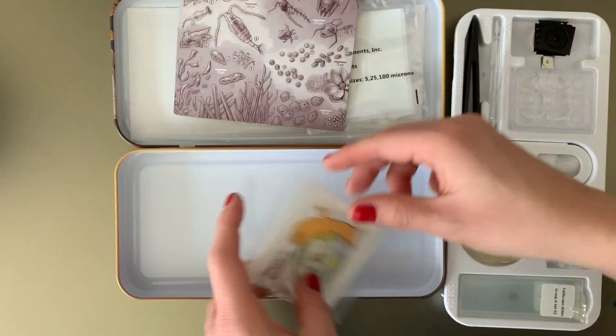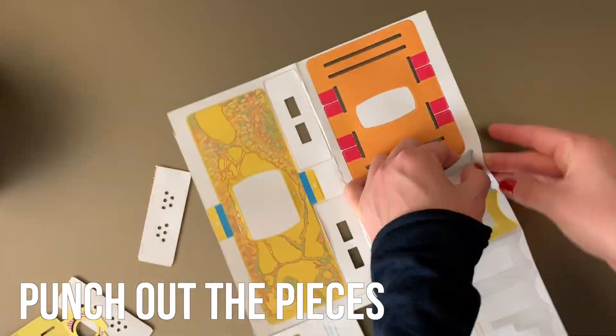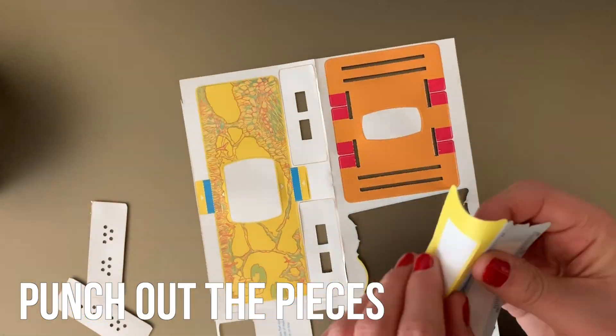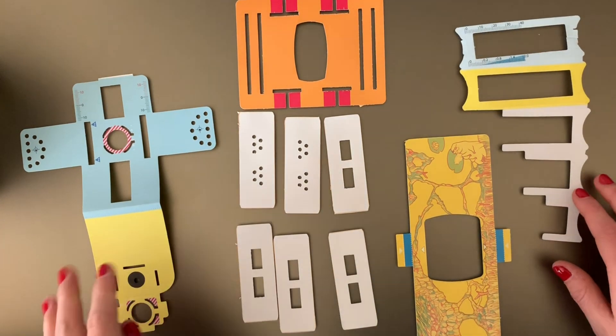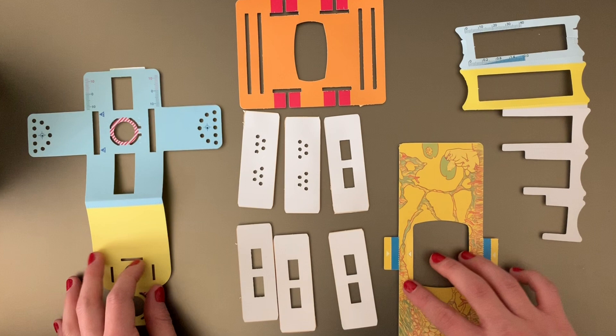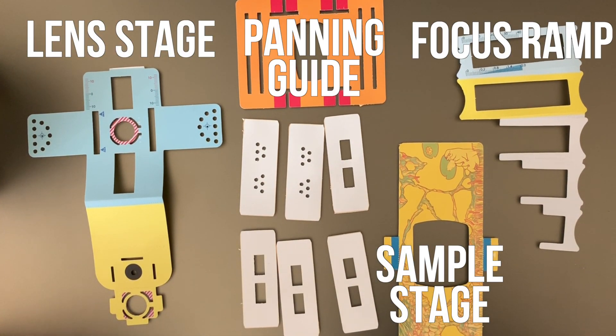Now let's get to making the Foldscope! Start by carefully punching out all of the pieces of your Foldscope. The main pieces of the Foldscope are the Lens Stage, Sample Stage, Panning Guide, and Focus Ramp. It also comes with a number of paper slides.